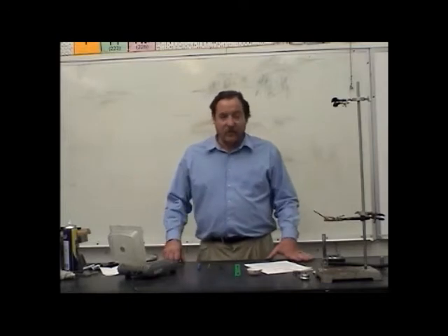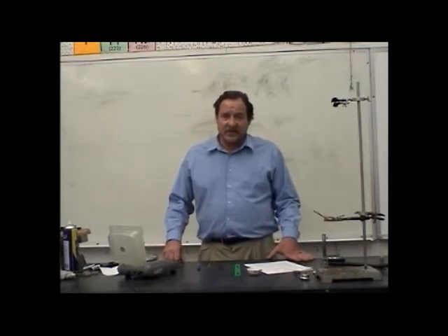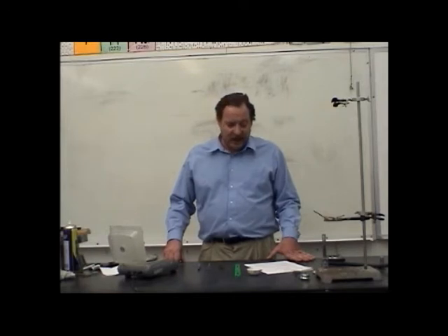Here to prepare you guys for the stoichiometry percent yield lab. The purpose of this experiment is to get students to be able to calculate the theoretical yield of a combustion reaction, and also to calculate the percent yield of their experiment.